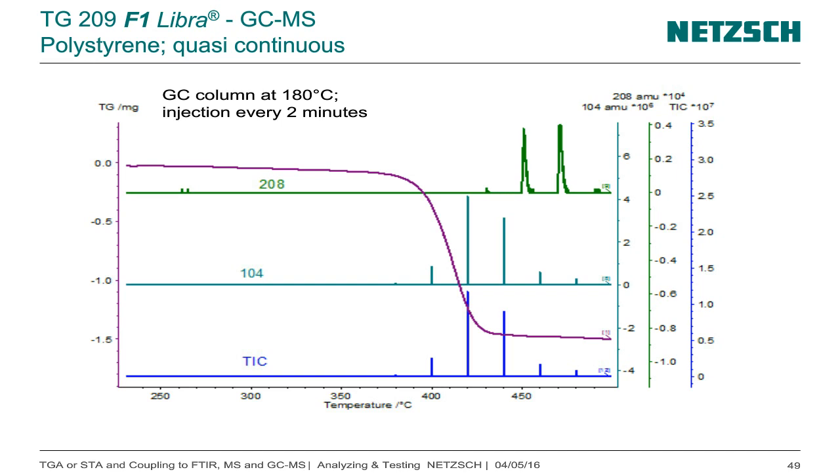And I can tell you this picture is wrong, because I have imported it via time. And normally with a TG, if you have a heating rate, it's independent whether you look by time or by temperature.